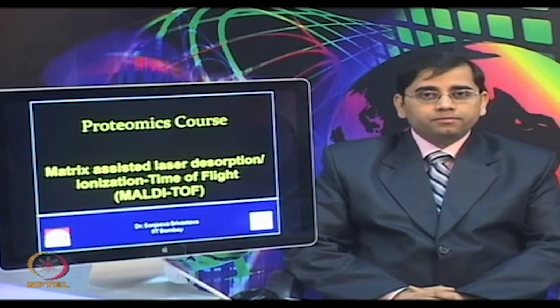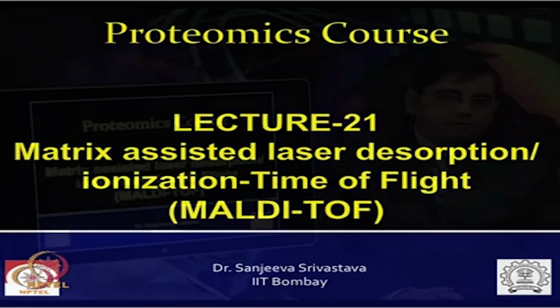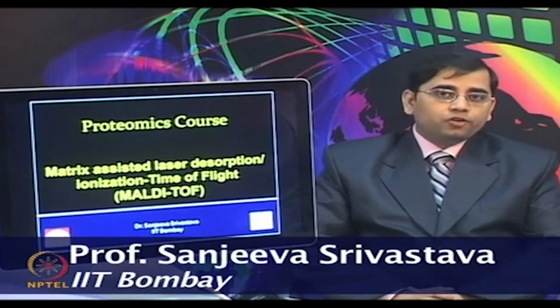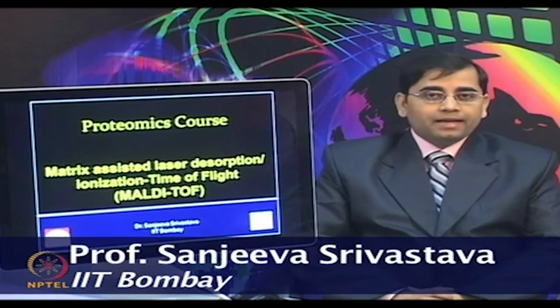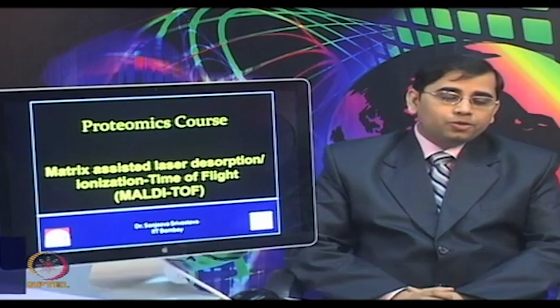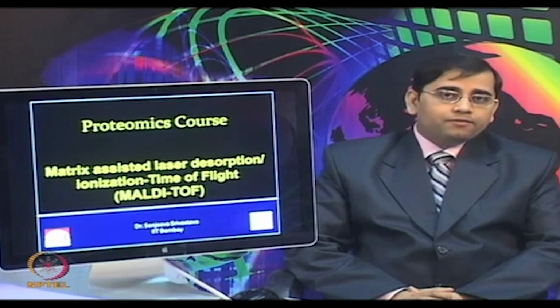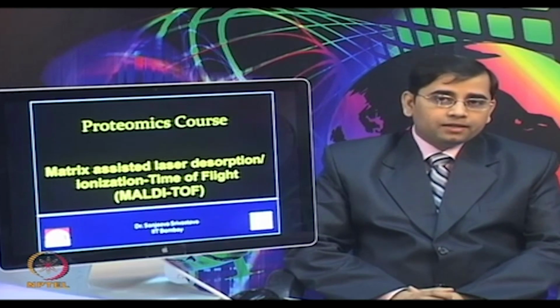Today we will talk about matrix assisted laser desorption ionization time of flight, MALDI-TOF. In the previous lecture, we talked about the basics of mass spectrometry, the various combinations of mass analyzers and ionization sources. Now, it is time for us to combine those and start discussing these in more detail. So, today let us focus on MALDI-TOF, which is one of the very widely used techniques in proteomics.